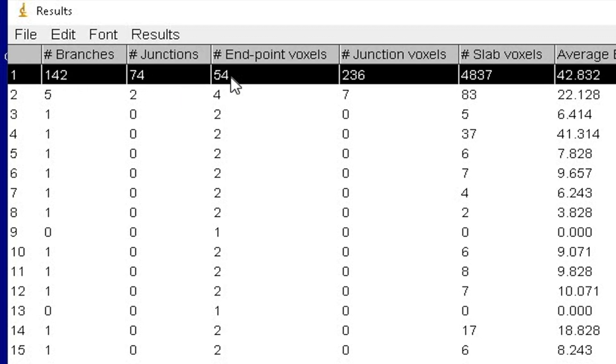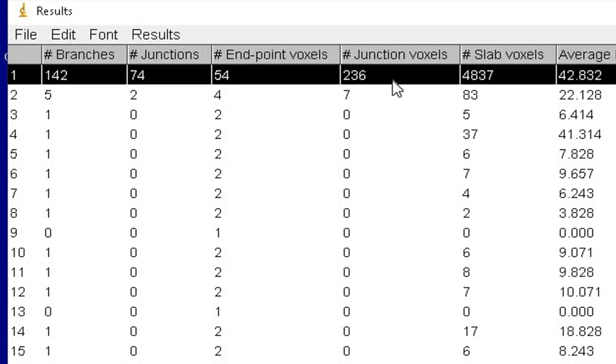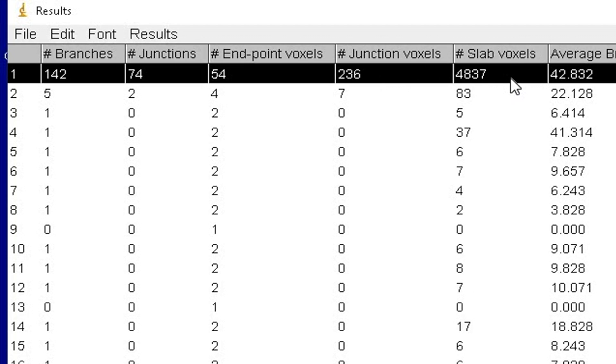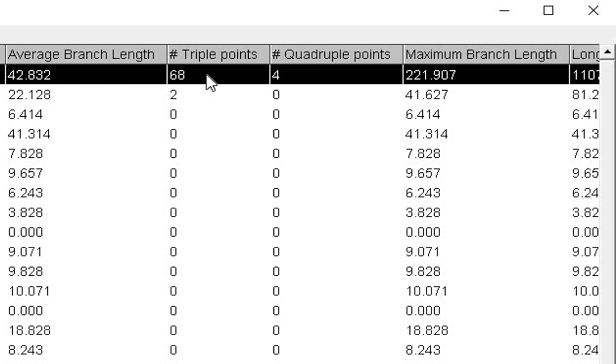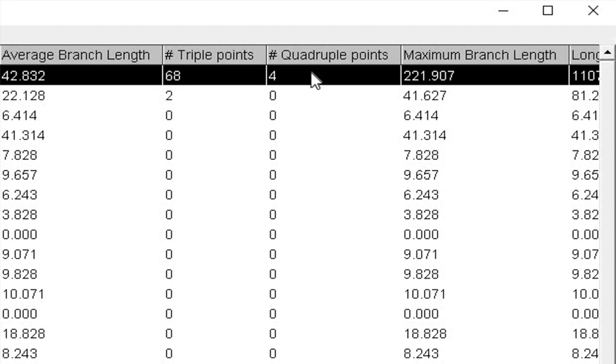The number of junctions as 74, endpoint voxels as 54, junction voxels as 236, and 4837 slab voxels. It also displays the average branch length. Further, it displays how many triple points and quadruple points are found in the branch.